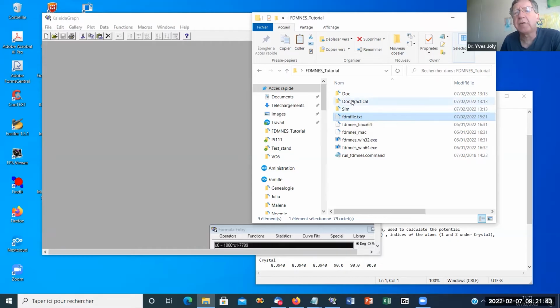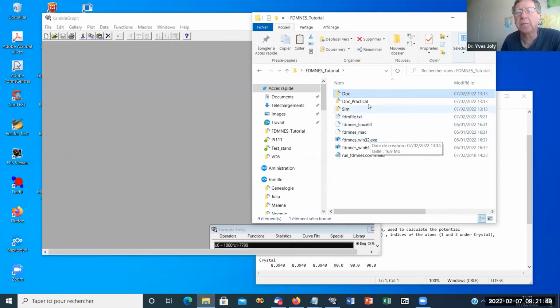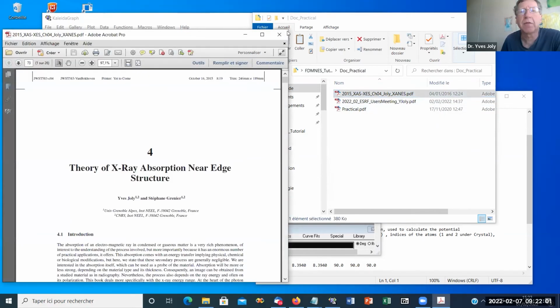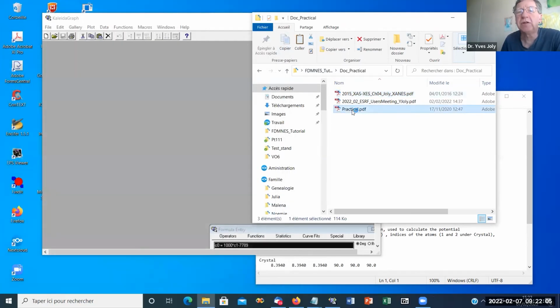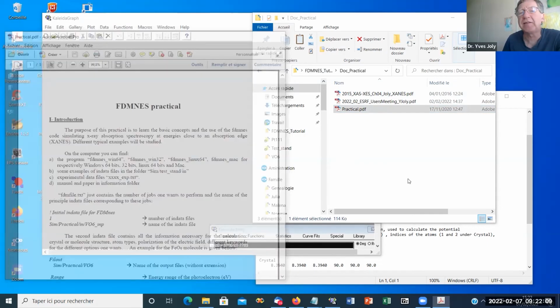Yes, I didn't mention, in doc it's the traditional doc you get when you download the code. But here are the docs for the practical. So you have the presentation I did at the beginning. You have a chapter I've written in a book about the theory of X-ray absorption near edge structure, and here is what we are doing right now, more or less.